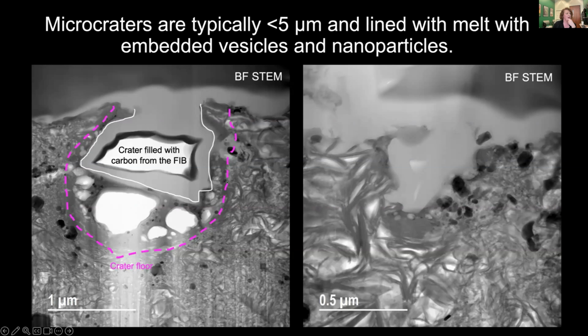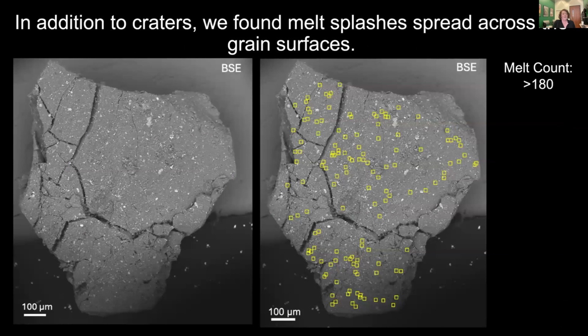And then we can compare these microcraters one to the other to see how the size, how the diameter to depth ratio changes. All of that can tell us about the population of impactors that the surface of Bennu and grains in the soil were experiencing. In addition to our microcraters, we can also see evidence of those micrometeorite impacts in the form of melt splashes.